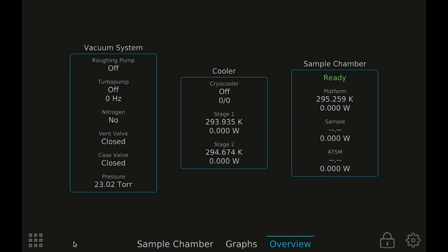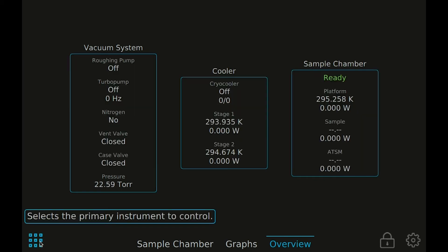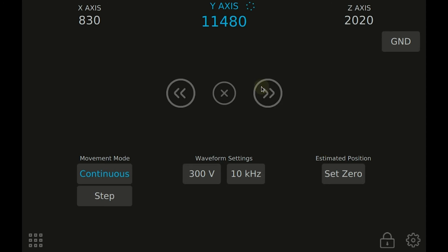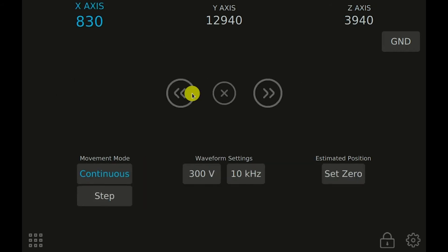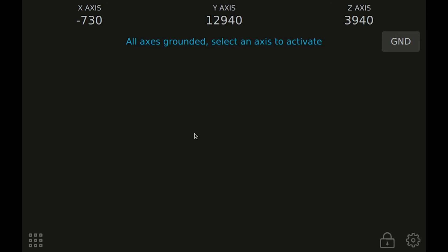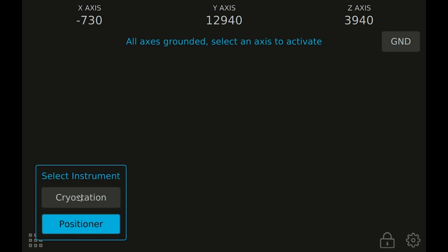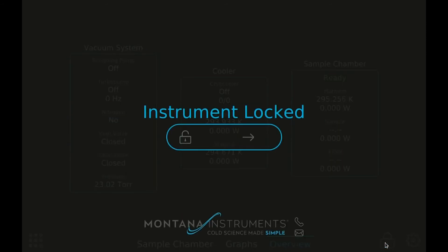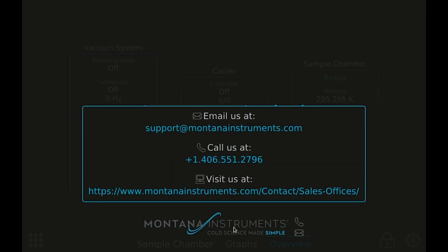If your system has more than one instrument installed, such as a cryo station with nano-positioners, then the button in the lower left corner can be used to switch between instruments. Each instrument has its own views designed specifically for that instrument. You can lock the display on your system by using the lock button — this can help indicate to other users that your system is currently in use or being controlled remotely. Press the logo to easily get our customer service information.